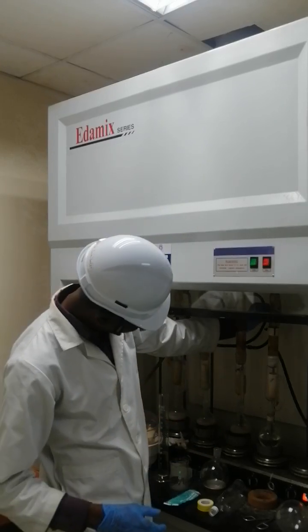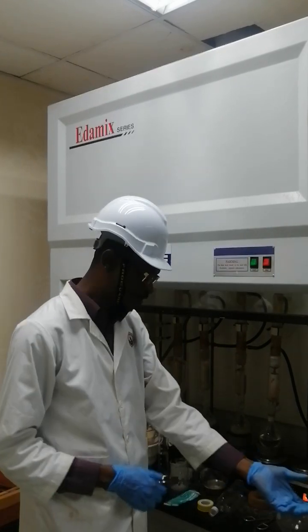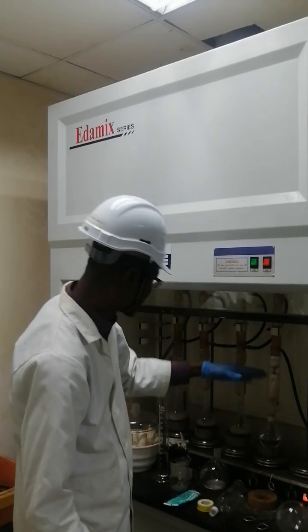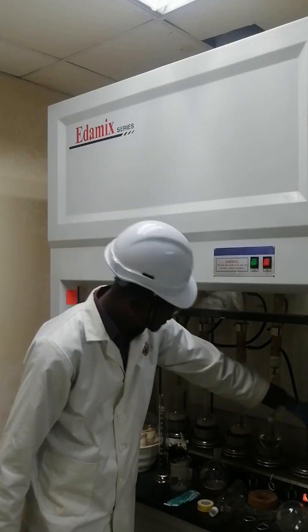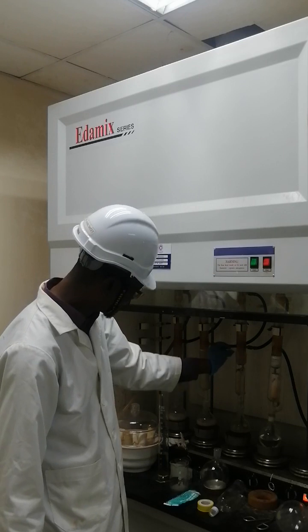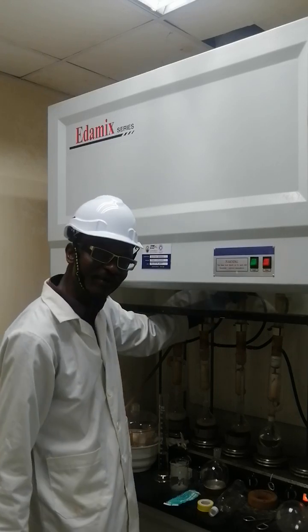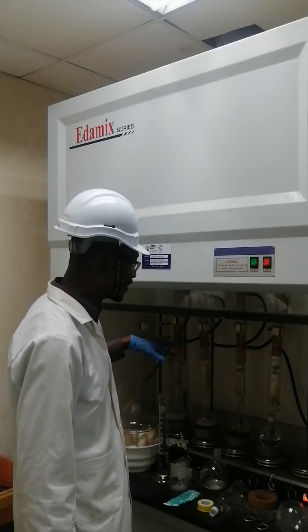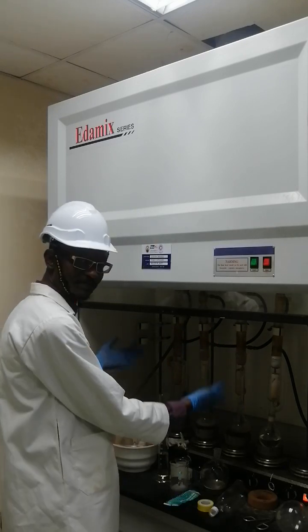Again, the water supplied to the condenser can be connected directly to the tap. In this case, it is connected directly to the tap, and the condensers are connected in series. In other words, the water from the tap goes to the first condenser here, and the outlet from the first condenser becomes the inlet to the second condenser, and the outlet from the second condenser becomes the inlet to the third condenser, and so on. So in other words, the condensers are connected in series, while the extraction is taking place in parallel.